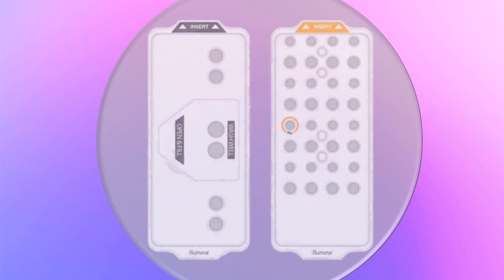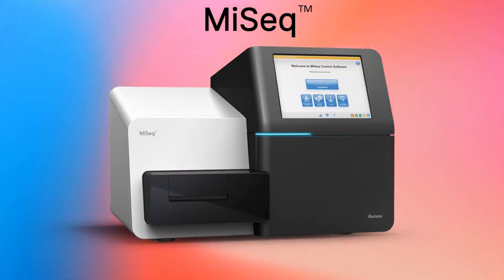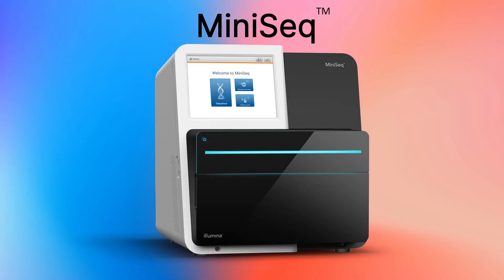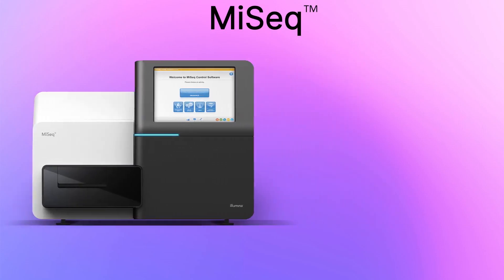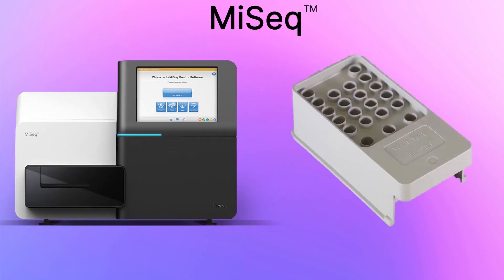Cleaning the wash cartridges can be applied to, but not limited to, the MiSeq, MiniSeq, NextSeq 500 and 550, and the NovaSeq. In this video, we will be using cartridges from a MiSeq and NovaSeq.